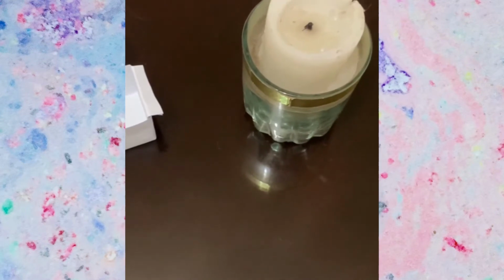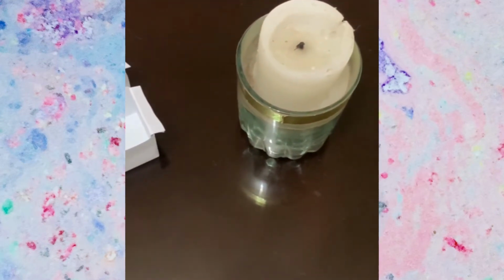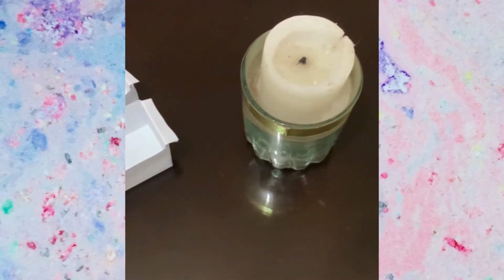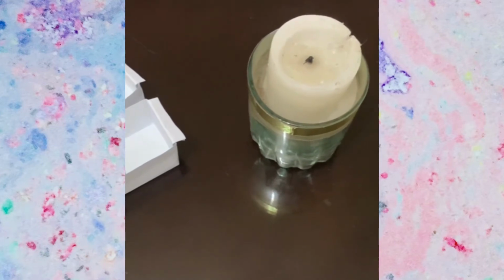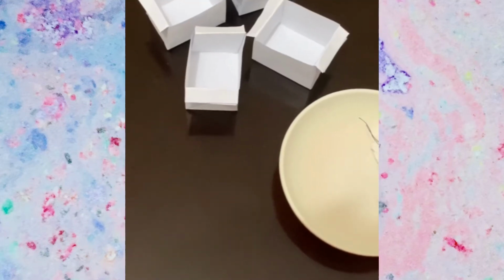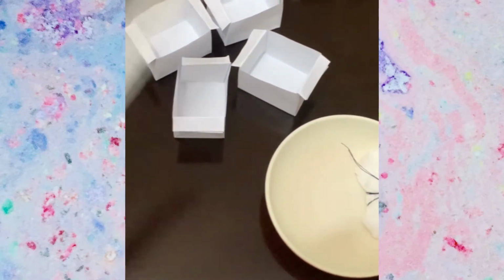After the last paraffin wax bath during infiltration, prepare your embedding molds. We should make sure that there is one mold per tissue only. Check the paraffin dispenser as well. Make sure it has enough melted paraffin wax. Remember to attend to one tissue sample at a time. Release the tissue first from the tissue cassette from infiltration.